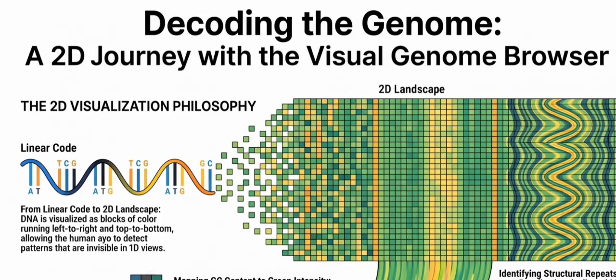And the visual feedback provided for these variants goes far beyond simply highlighting a changed letter. If a variant happens to fall inside a crucial coding exon, the software automatically translates the implication of that change. Because changing a DNA letter often changes the amino acid that gets built into the final protein. Exactly. In the software's protein view panel, any amino acid changes caused by the patient's variant are aggressively highlighted with bright magenta rectangles.